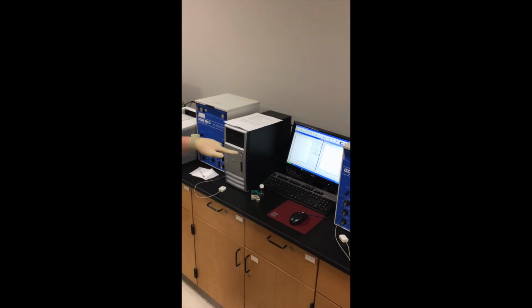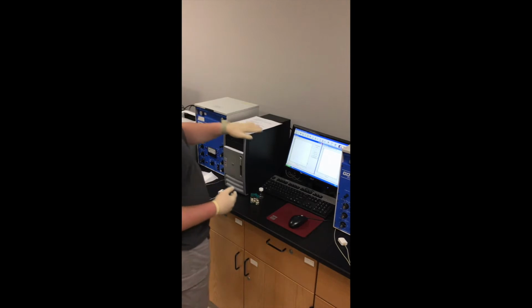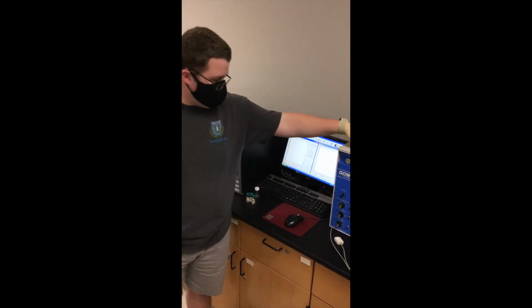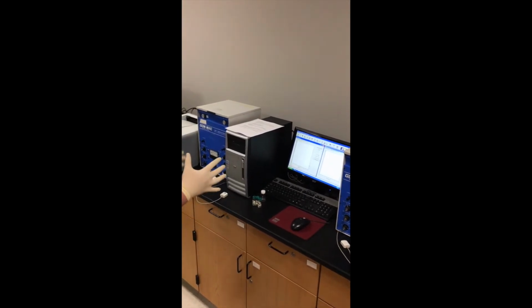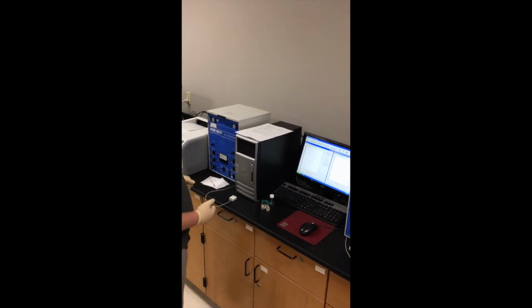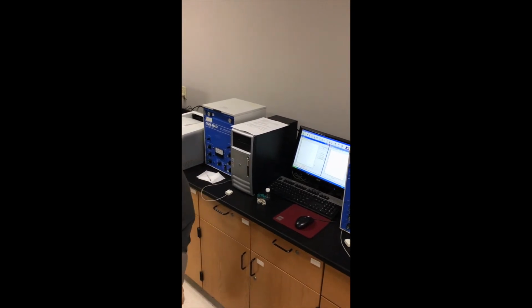There are 2 individual screens for acquiring data, and they're normally just named Channel 1 and Channel 2. In this case, Channel 1 pulls information from this chromatograph, and 2 pulls from this one. Whenever you run a GC, you'll be over here associated with this, and you'll probably have a lab partner working on the computer. Then you'll inject your sample and take your information on the GC.